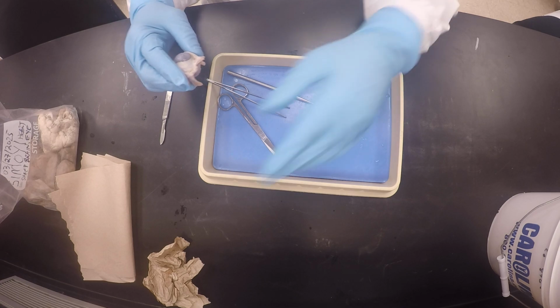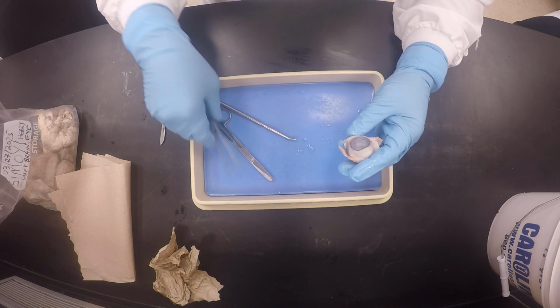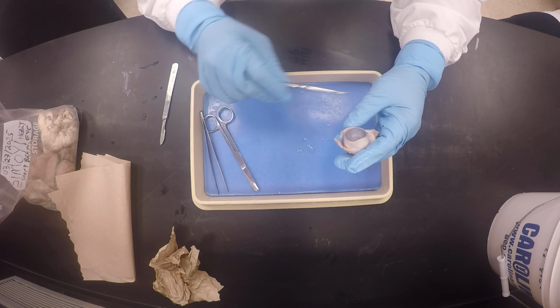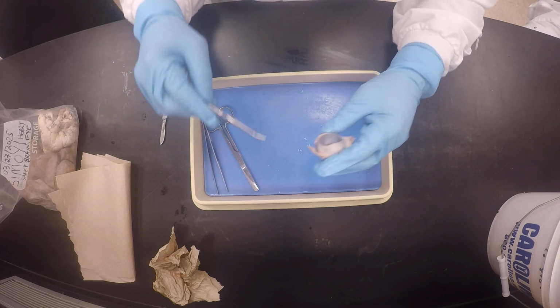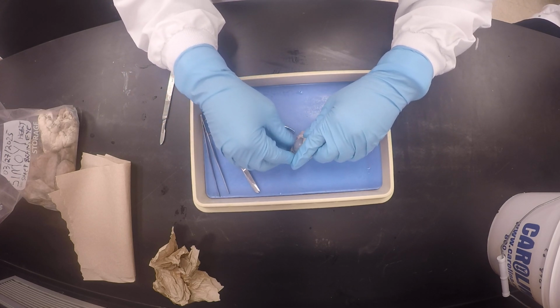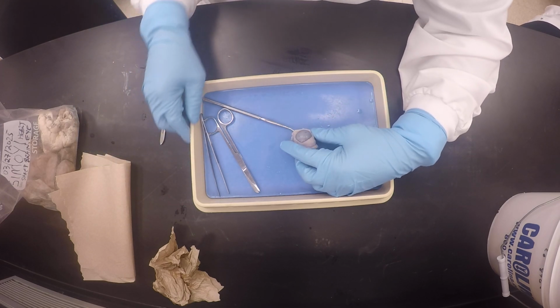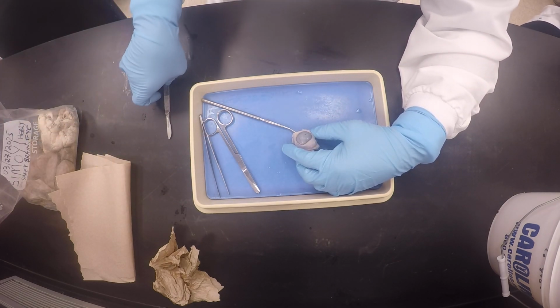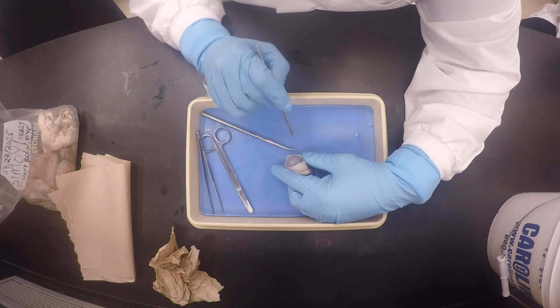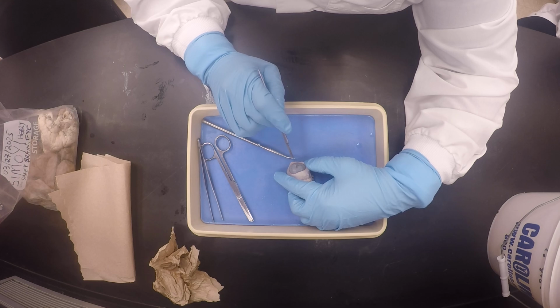This is so slimy. It's really doing it for me. So we've identified the extrinsic eye muscles, and we've identified at least the fibrous tunic, the cornea, and the sclera in the back there. So we're going to make an incision like this from one short side to one short side. You take the scalpel, and we're on the camera, so you make a central incision, as central as you can.